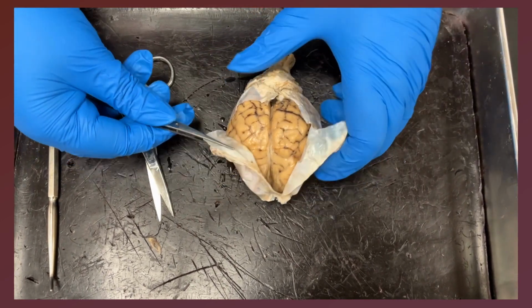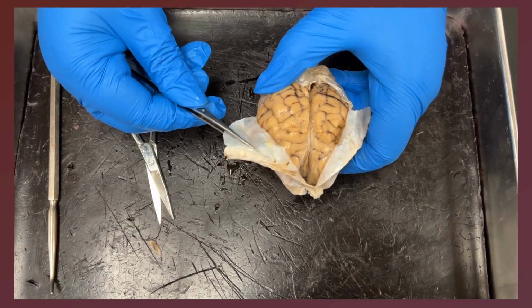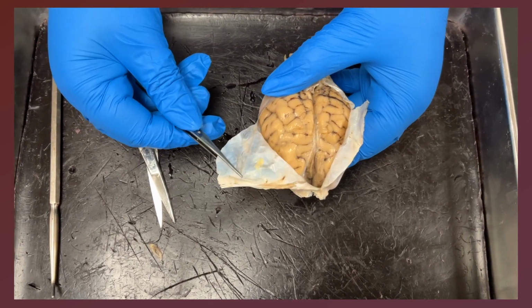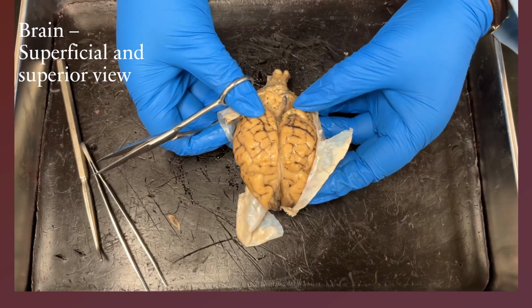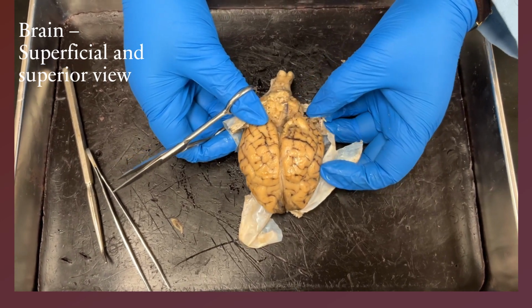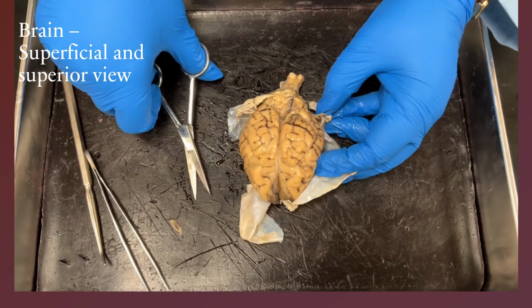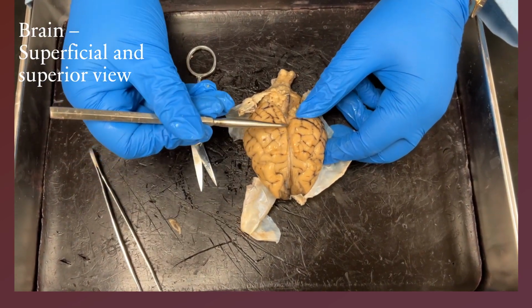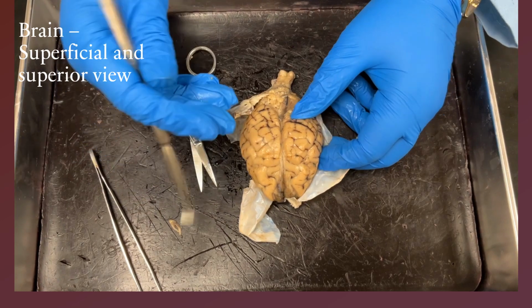This is dura mater, which means the strong mother. You can really truly see how strong this is. I am clearing the meninges on top from the brain distinctly. See, this is through this line, that's the longitudinal fissure.